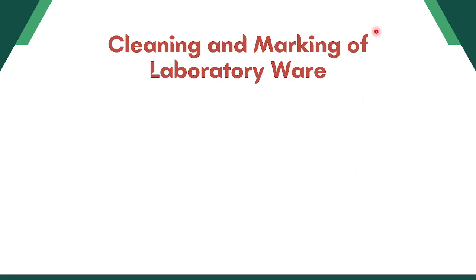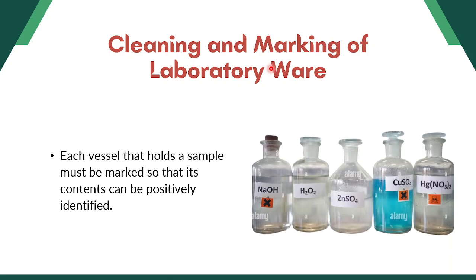Now, how do we clean and mark our laboratory materials or mga laboratory glasswares na to? Now, later on in class, each of you mag-groupings man ta. And then, naay specific nga mga chemicals nga gamiton.